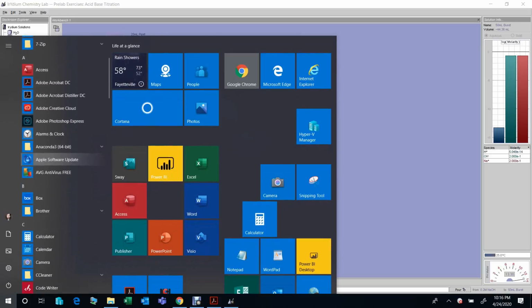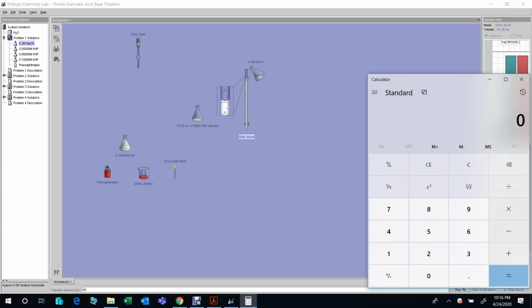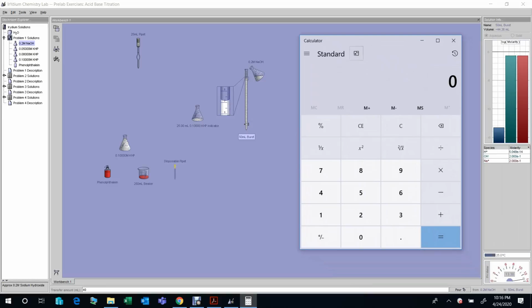And then let me see, I need to get a calculator. The difference of the reading is the volume we add. So at the beginning the reading is what? It is 50, right? Remember, 50. And now the reading is 6.90. So yeah, we add 43.1 milliliter.